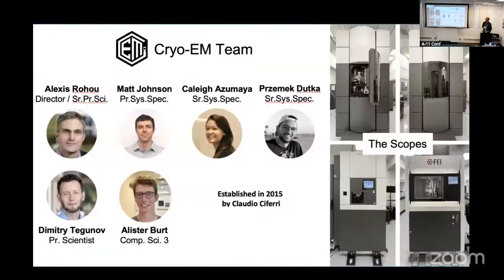So I work in the Cryo-EM team at Genentech. I was quite surprised because I thought industry meant that everything was done at an industrial scale, but actually the Cryo-EM team itself is about 6 or 7 people in a 13,000 plus person company on site just south of San Francisco. The team was started in, I think, 2015 by Claudio Ciferri. It's now run by Alexis Rohou, who you might know from things like CTFFIND and cisTEM.